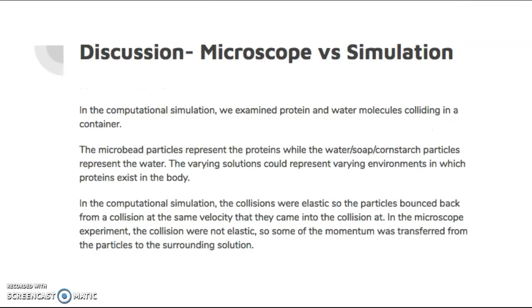We can also compare this experiment with a microscope to the computational simulation that we did regarding diffusion. The microbeads in this experiment represent the proteins that we saw in the computational simulation, while the water, soap, and cornstarch particles represent the water from the simulation. The varying solutions could represent different environments in which proteins exist in the body.